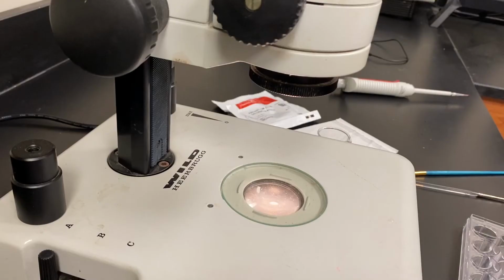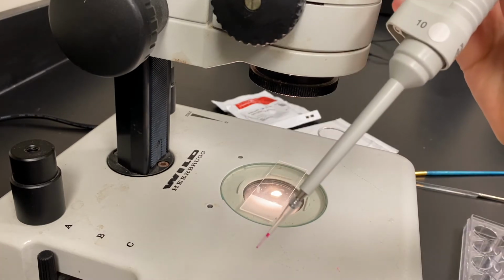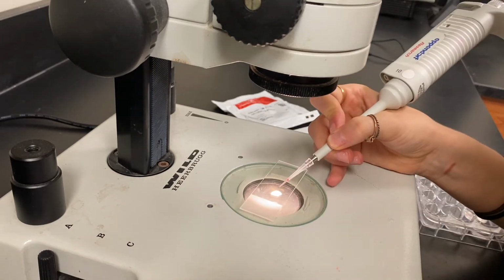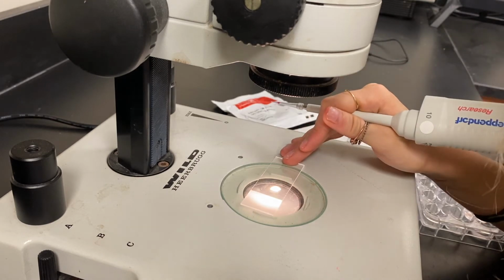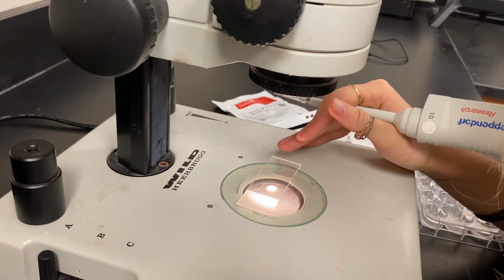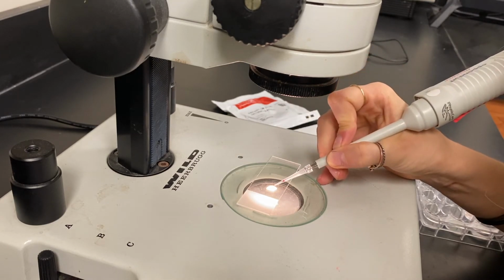Working with the dissecting microscope has already been a huge help, and I honestly don't know why I didn't think of it before. Now I can actually see what I'm doing. Oh, and side note, this is not how you hold a pipette, but it gave me a lot of control, so I think the position of this dye will actually be the best.